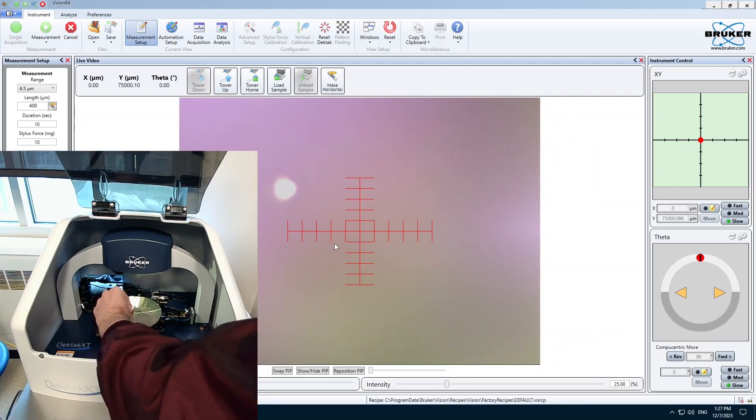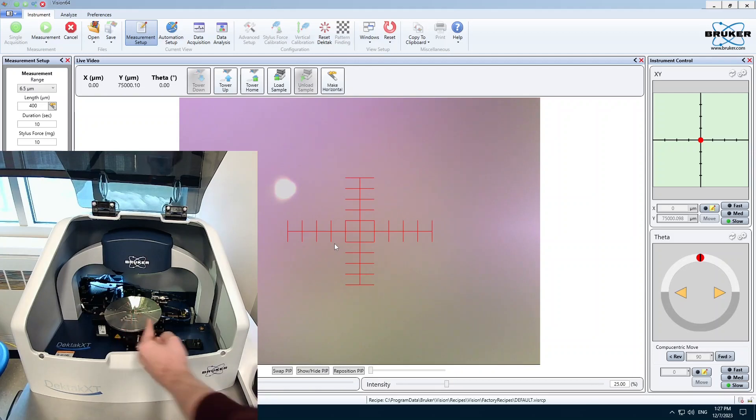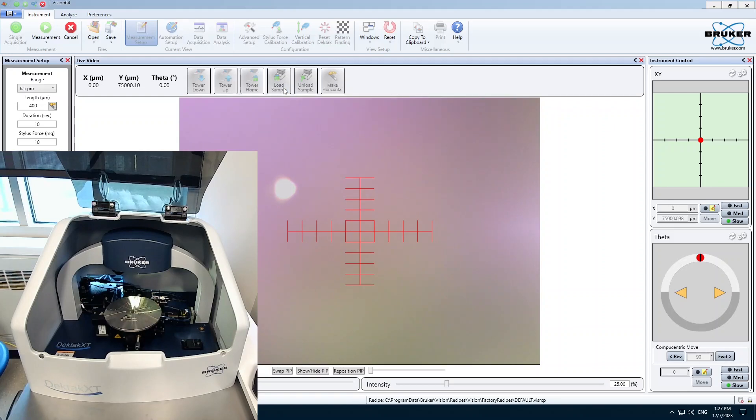The instrument is going to be scanning in this vertical direction, so think about how you want to scan across your image in that direction. And I can click Load Sample.